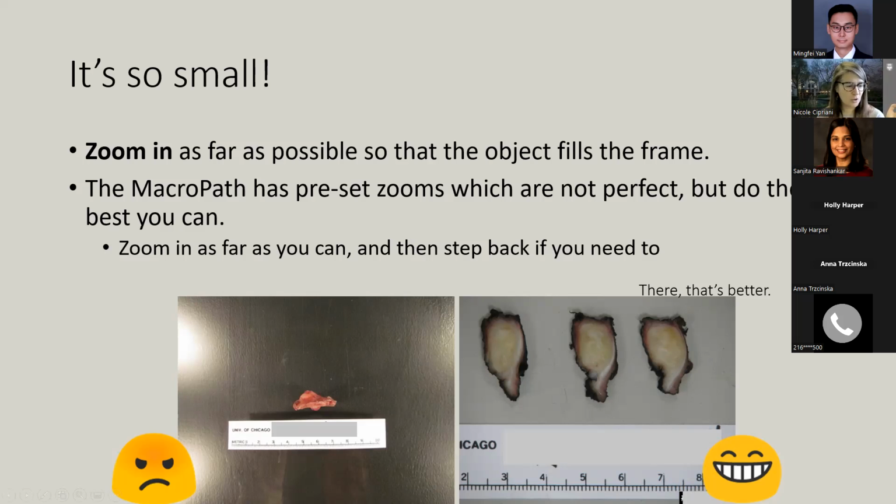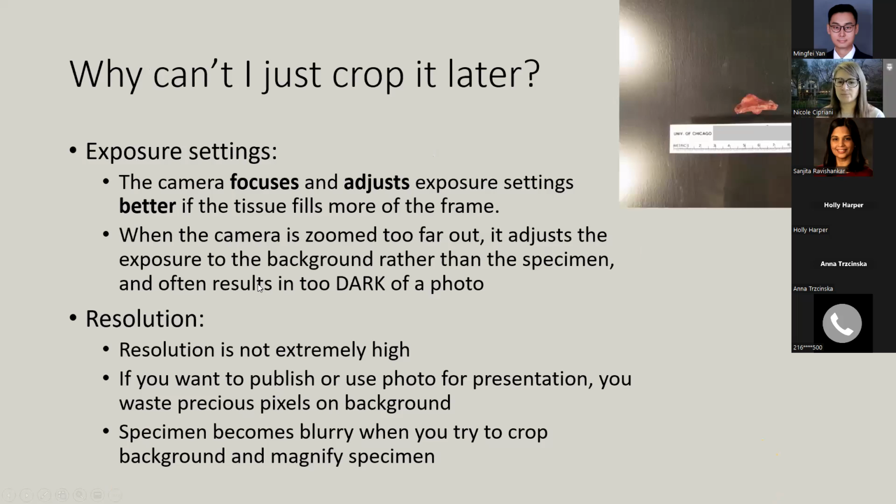We have a crop function in CoPath that automatically expands the cropped image once you save it. Yeah, so why can't I just crop it later?